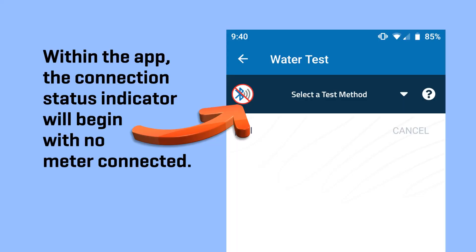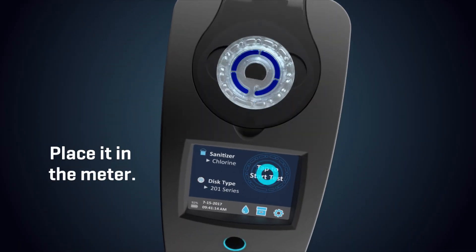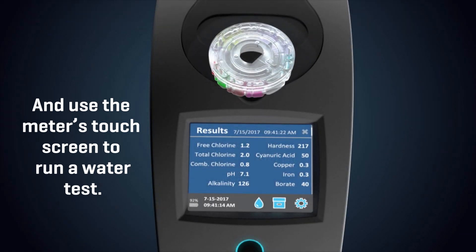Within the app, the connection status indicator will begin with no meter connected. Fill your spin reagent disc, place it in the meter, and use the meter's touch screen to run a water test.